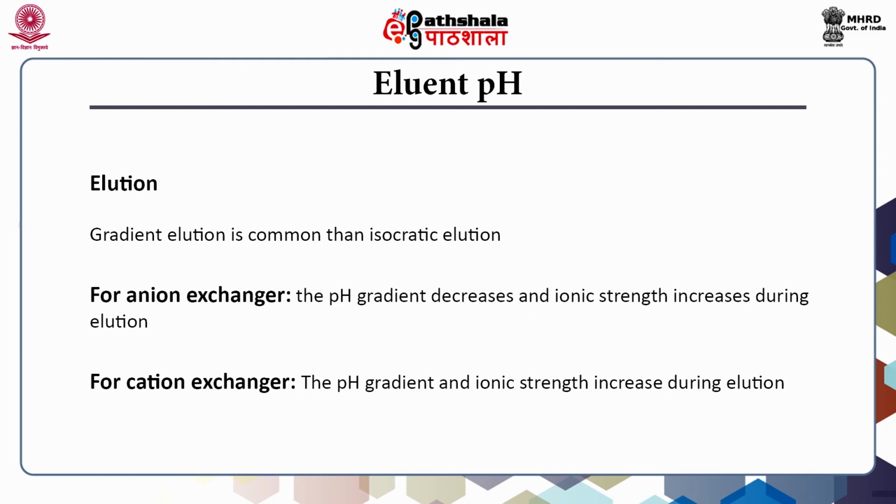That means they will lose their cationic state and enter into the neutral or anionic state, so that on the cation exchanger the proteins can be easily replaced with other positively charged ions, generally sodium ions. So, let us see the procedure of ion exchange chromatography in the next slide.